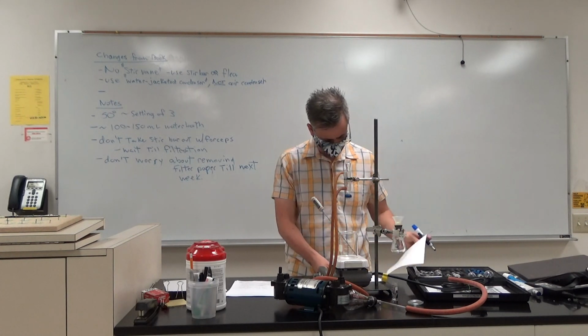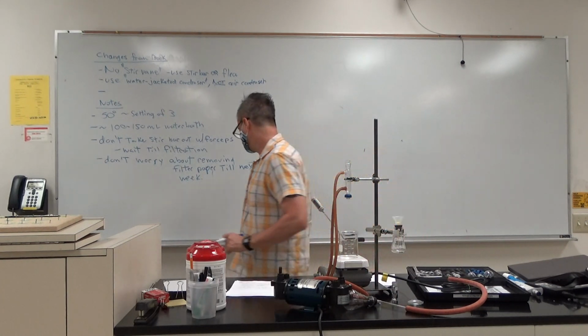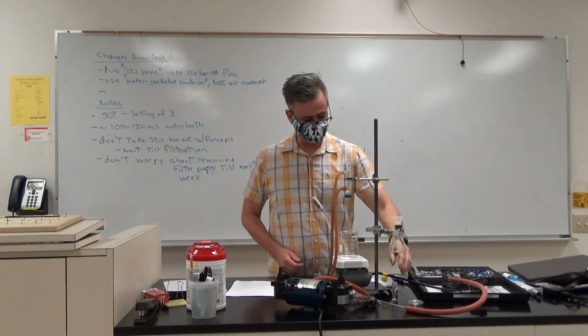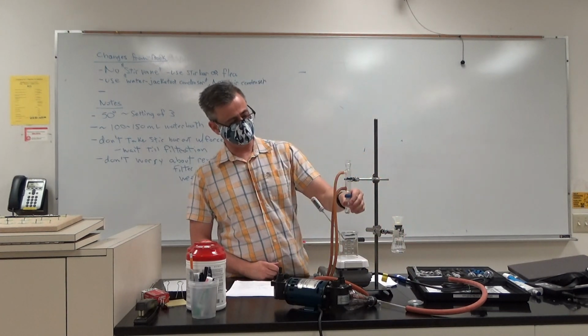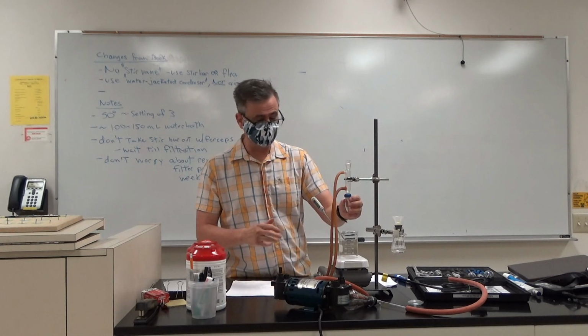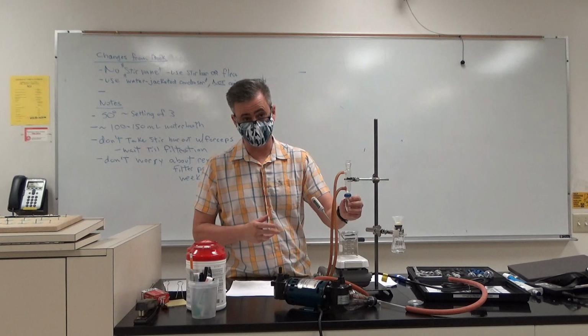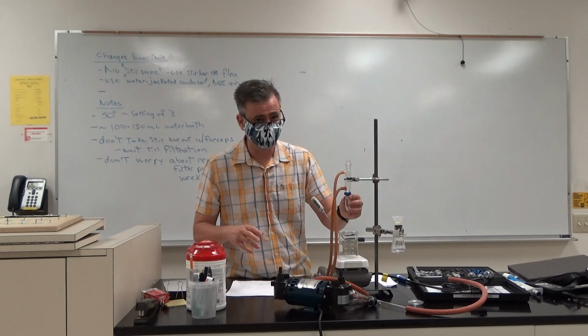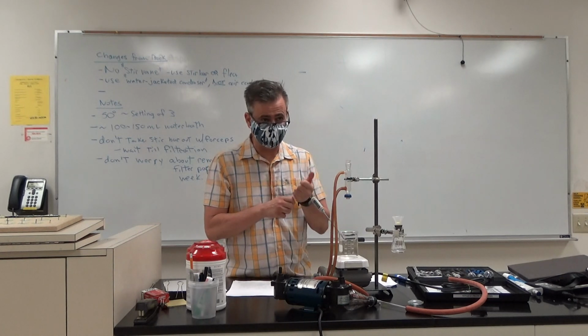I guess actually one thing. Yeah. It says to don't scratch. At the very end, what hypothetically is going to happen is you're going to set it up here and boom, you get crystals. Okay? In general, we want crystallization to happen slowly. That's why you just set it up there and you wait a little bit. Probably won't get crystals. Maybe you will, maybe you won't. Okay? It says to scratch.